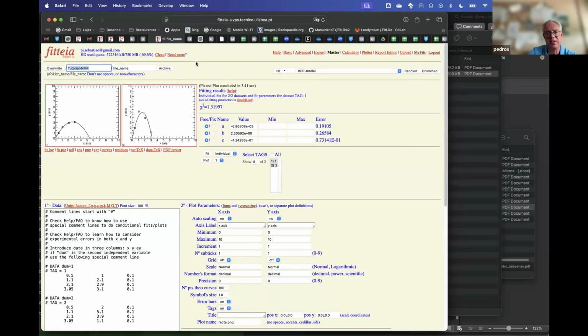Once you save this project in a more permanent way, because I must tell you that everything that I'm doing here will vanish if I close the browser, if I go away. There is no memory of this. This is stored in the system. You can use it when you are logged in the system, when your system is on. But if you close it, if you log out, eventually this information will be lost.